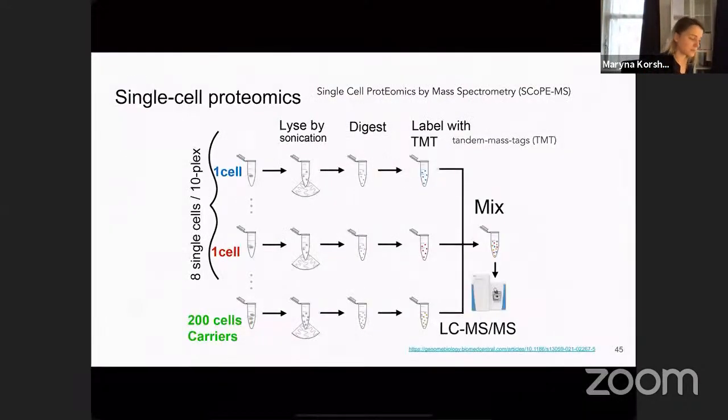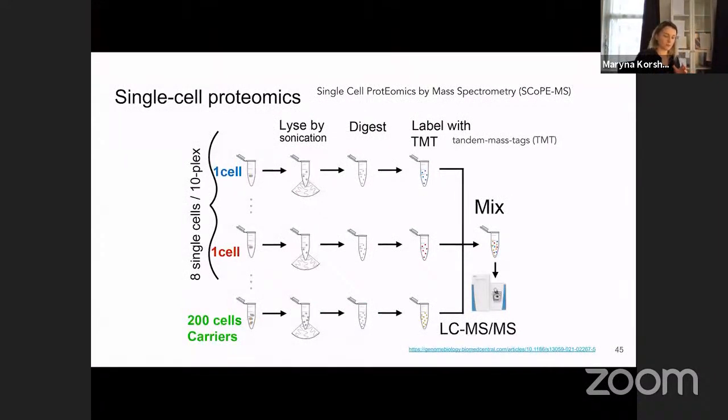So as we discussed right now, with the coupled measurements of single cell proteins and single cell transcriptomics, you might use these oligonucleotide barcoded antibodies, but also you can do pure single cell proteomics by itself, and then match this with pure single cell transcriptomics or other single cell multi-omics data.